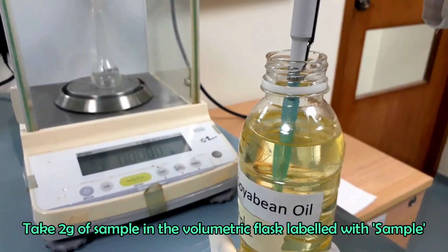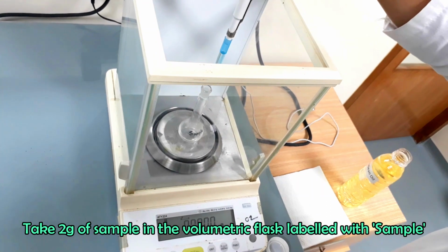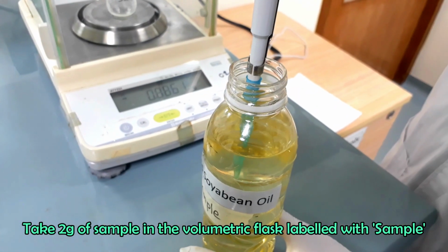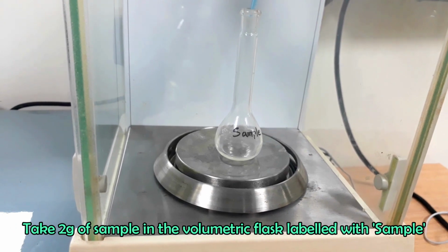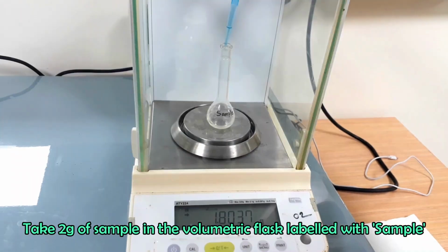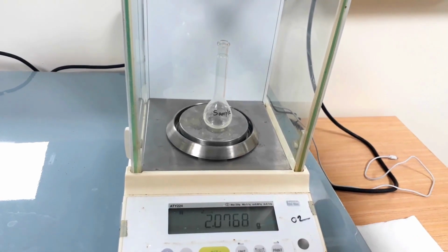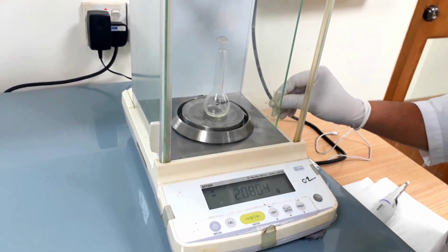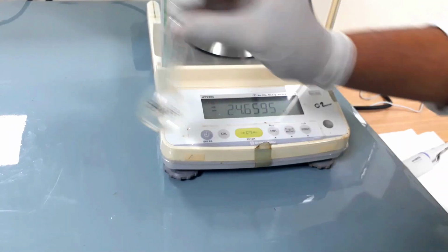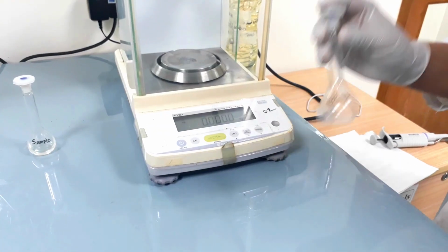Take 2 grams oil sample in the flask labeled with sample to prepare sample in it. Note the sample weight. Now take 2 grams unfortified oil in another flask in which sample blank will be prepared.